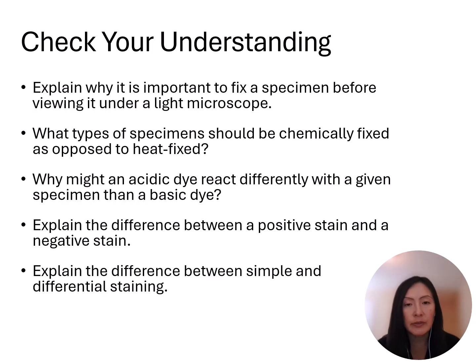The last one, difference between simple and differential staining. Simple stains are usually just one step. You're just using one dye to color everything the same color. In differential staining, you're using multiple dyes to distinguish between organisms or between structures within the organism.